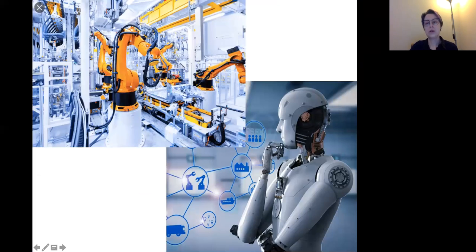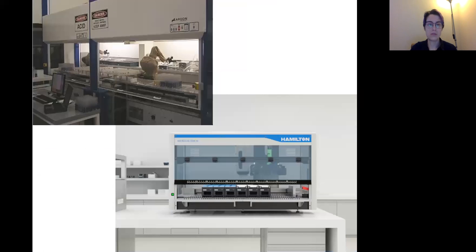When we go to a lab robot, what we have in front of us actually is more something like this, which is more like a cabinet in which there are some 96 well plates that some of you may be already familiar with, and then there's just one arm that goes around picking. These are the big fancy ones.